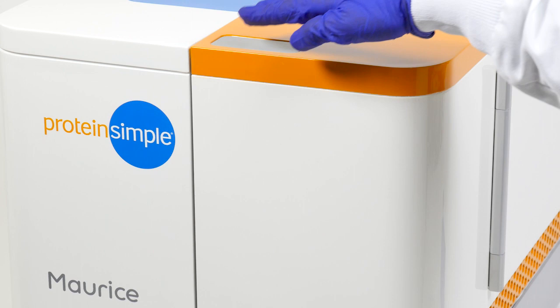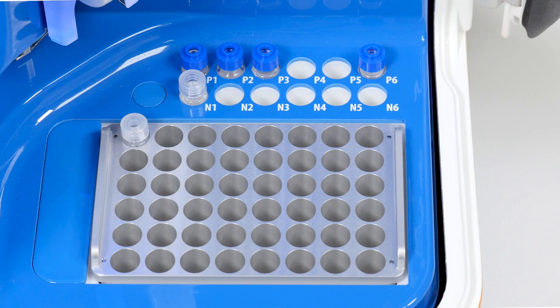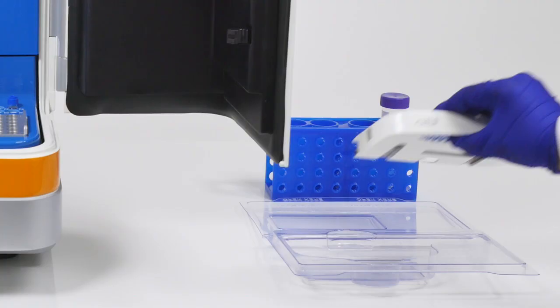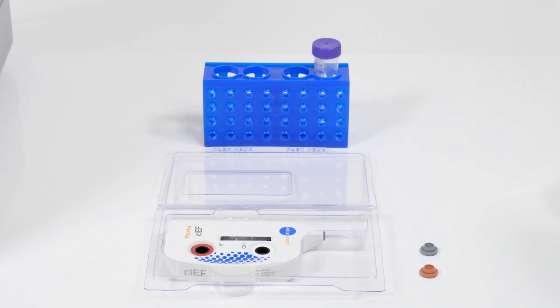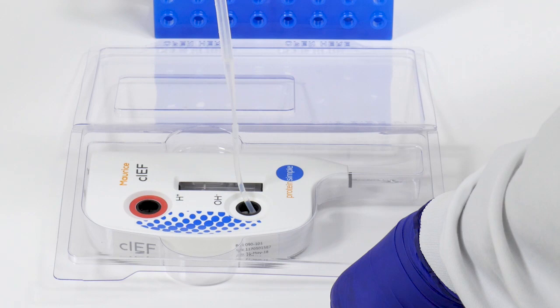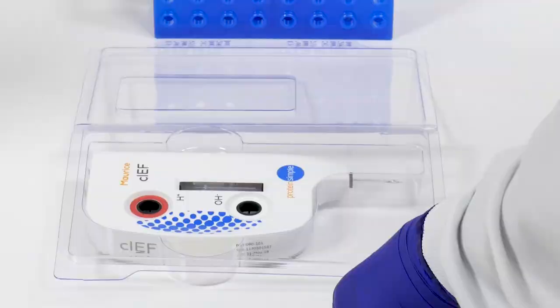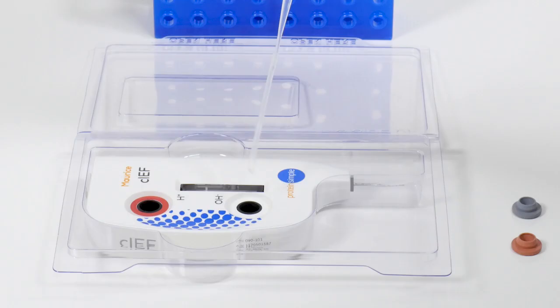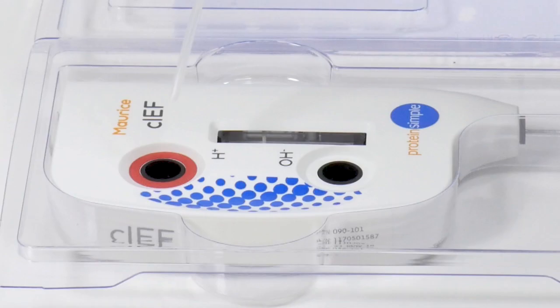At the end of the run, touch the silver button to open the Maurice door. Remove all of the reagents and samples and dispose of them appropriately. The light around the cartridge should now be orange. To remove the cartridge from Maurice, grab onto the finger holds and lift up slightly and pull back, again being careful not to bump the capillary inlet. After placing the cartridge on its side on the bench, use the electrolyte transfer pipettes to remove the anolyte and catholyte solutions from the cartridge, and rinse each reservoir three times with distilled water. After the third rinse, ensure that all of the liquid is removed from both reservoirs and place the cartridge back in its original container to dry.